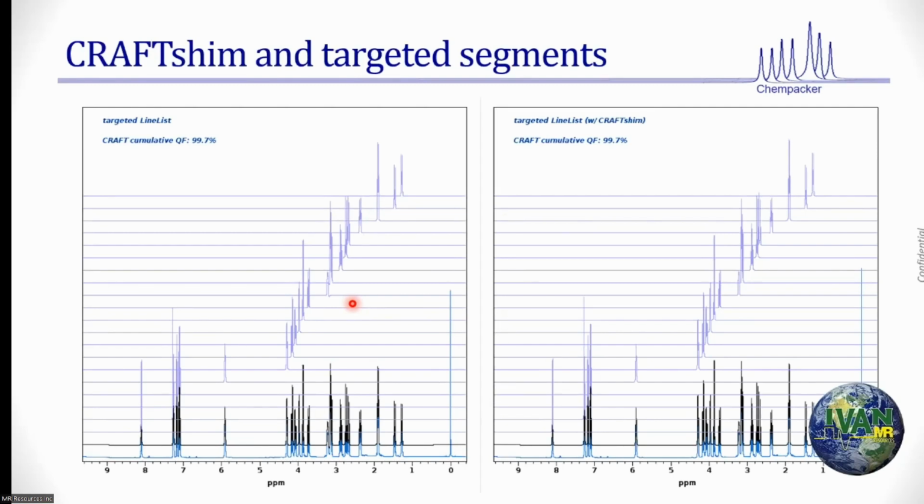because I'm a chemist. I looked at that structure and I said, this is the proton. I didn't say that is a four-line pattern. I simply said that's a proton. So the moment I directed, I am biasing all the problems that we had with poor shimming, biasing simply because I am biased.